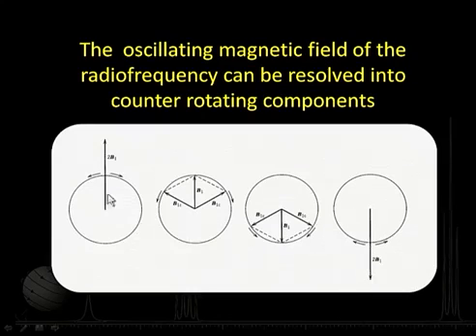So, what you see is that this is an oscillatory field over there. There are two ways of doing that. One is basically I am trying to look at a magnetic field which is oscillating, and that can be represented, or resolved, in terms of counter rotating components there. That is important. Now, what happens then? What happens then is that these rotating components will depend on the frequency of the radiation I am talking about there. Okay. Now, let us see here what happens.